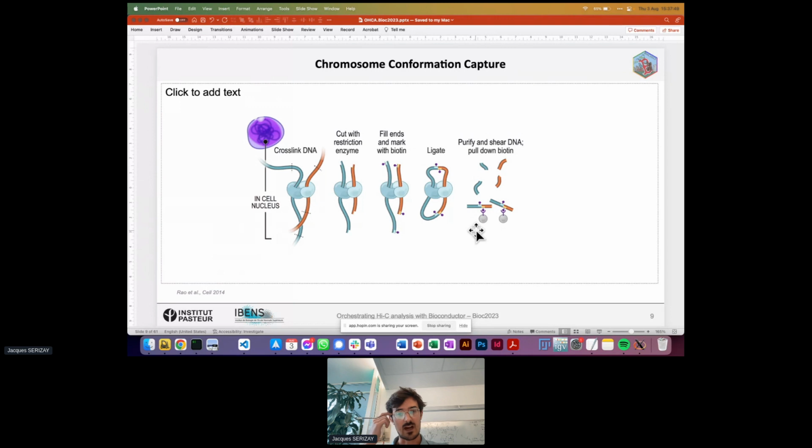And in the case of Hi C, one would ideally want to pull down chimeric DNA fragments that are labeled with biotin, and extract those and sequence them in a high throughput sequencer. So that's the experimental workflow for chromatin conformation capture experiments, and specifically for Hi C. There are some variants, including micro-C and DNA-C, and less genome-wide focused approaches such as 3C and 4C. But I'm going to talk today more specifically about Hi C and other genome-wide approaches.